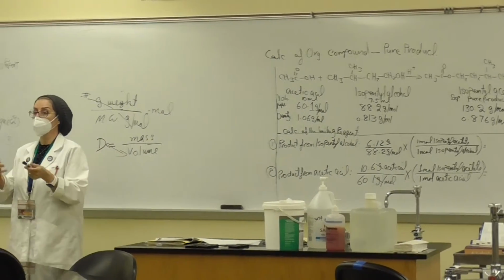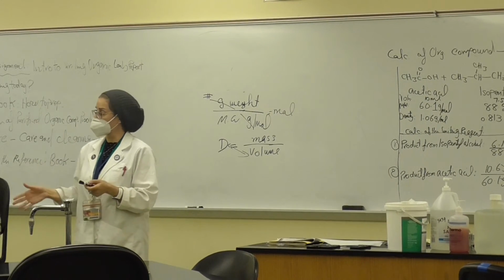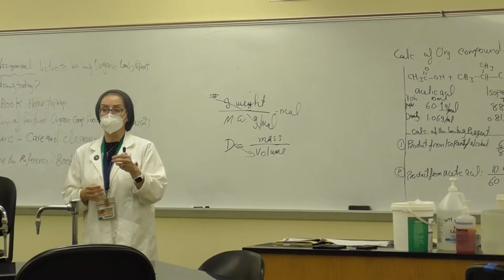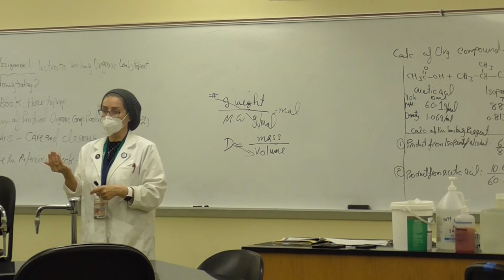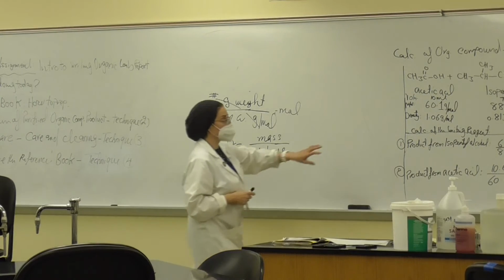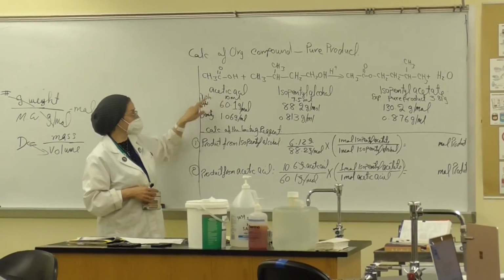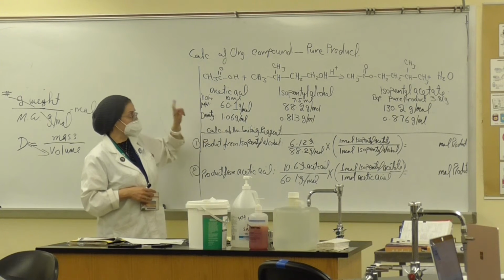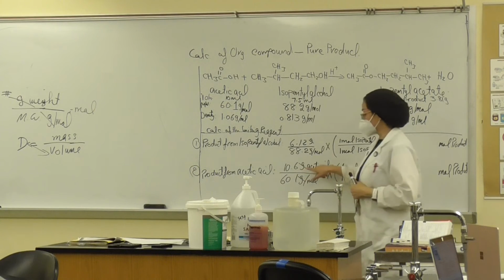How are we going to determine the limiting reagent? And from the limiting reagent, we will be able to calculate the number of grams of the product, right? So is everybody clear here with me? So remember, we multiplied 10 by 1.06. We got the acetic acid, which is 10.6 grams.